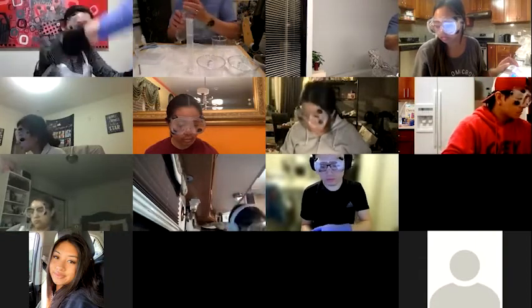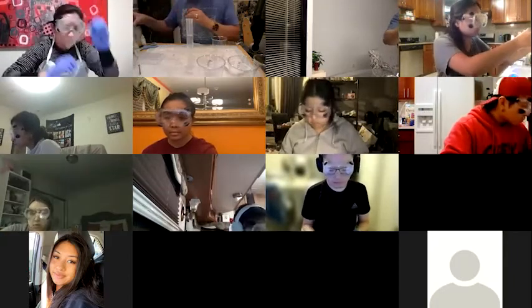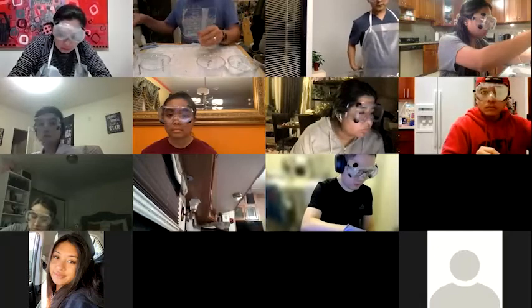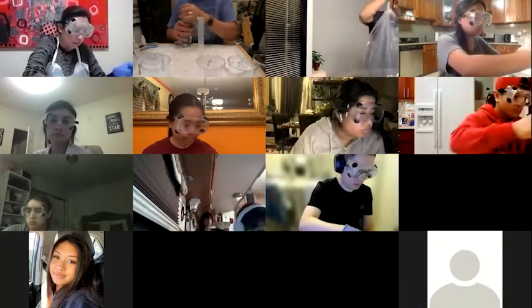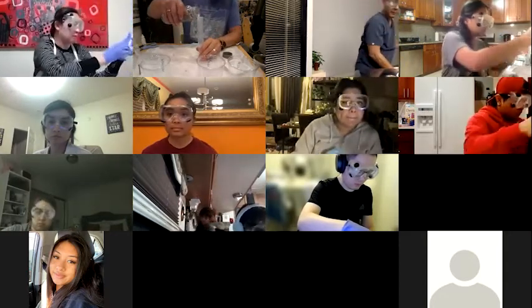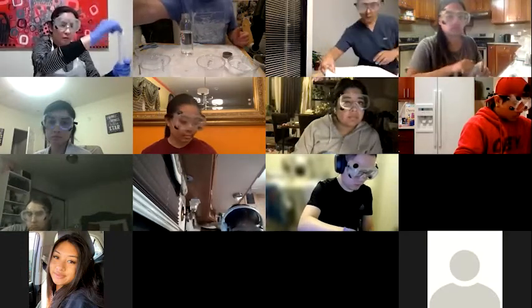So there is my first solution. Hopefully that is fairly close to 0.1 molar sodium acetate. And then we just continuously rinse out our graduated cylinder with water. Hopefully you're near a sink, or I just brought a large bowl downstairs.